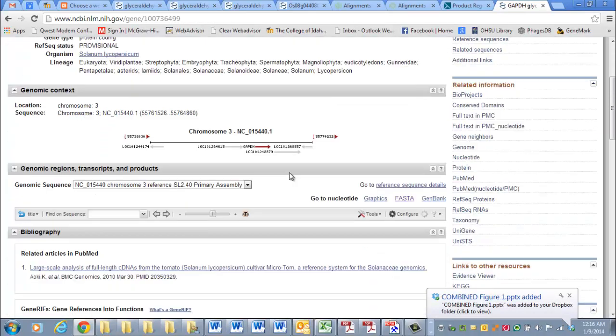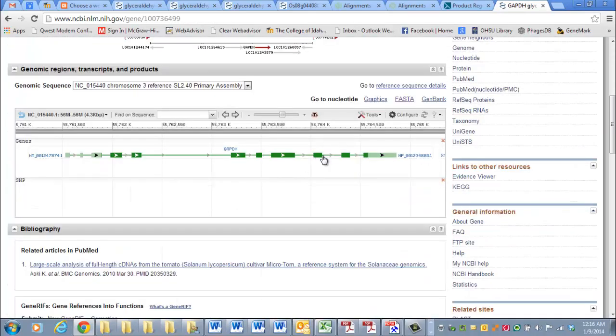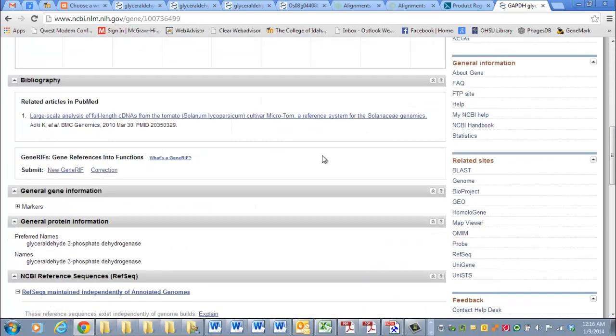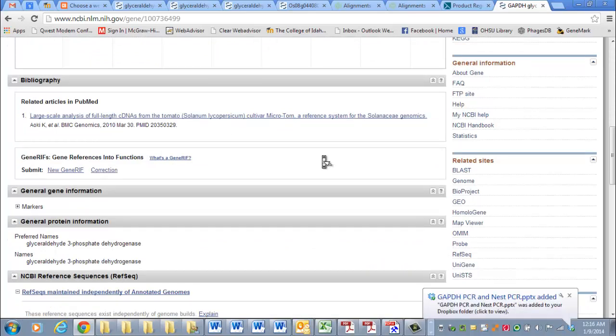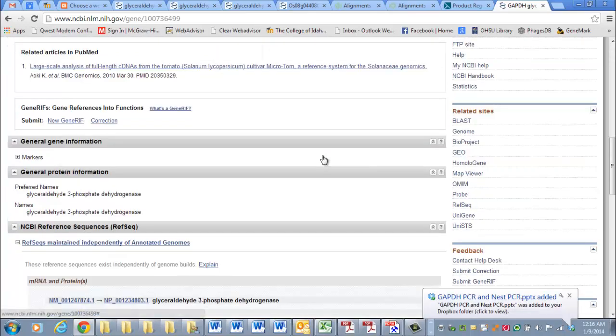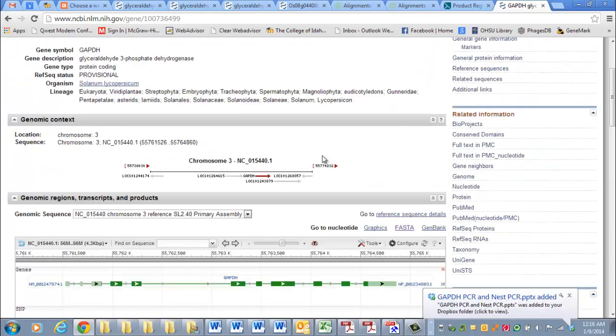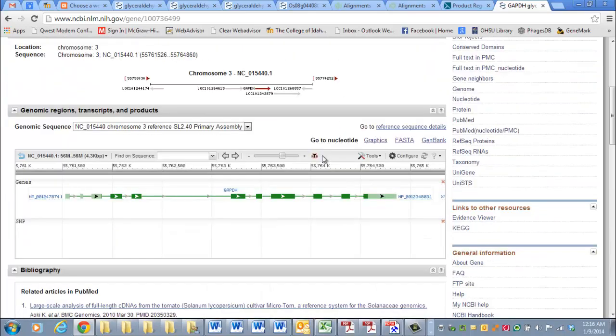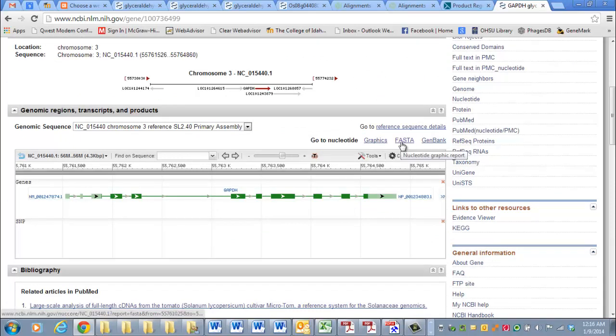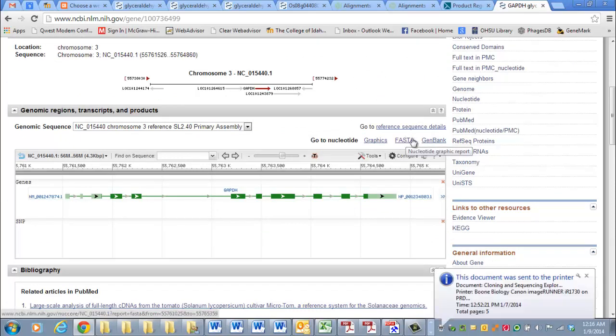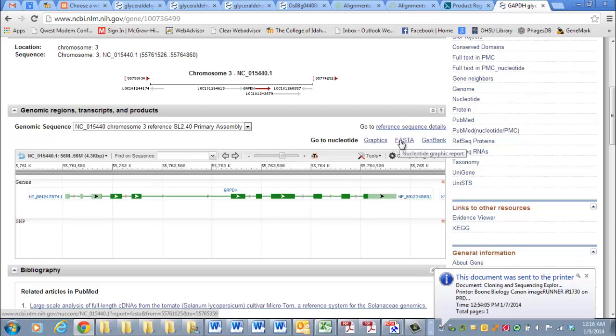So far, when you've wanted to see a DNA sequence, you can scroll down here to the FASTA box and click on it. That's where you've done that before. You've clicked on this FASTA box and you can scroll down from there to the nucleotides.